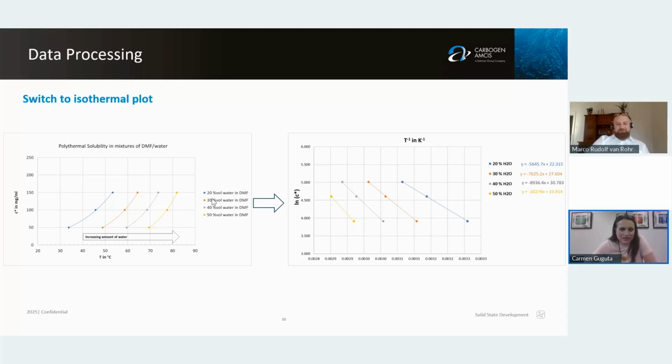Somebody's asking, with anti-solvent type of crystallization, can we use a syringe and use an anti-solvent type of reactor cap for generating the solubility as a function of anti-solvent directly? I think for the Crystalline, yes. For the Crystal16, you do not have a cap for the anti-solvent. You know that better than I do. So I have fixed composition in my vial. Yes.